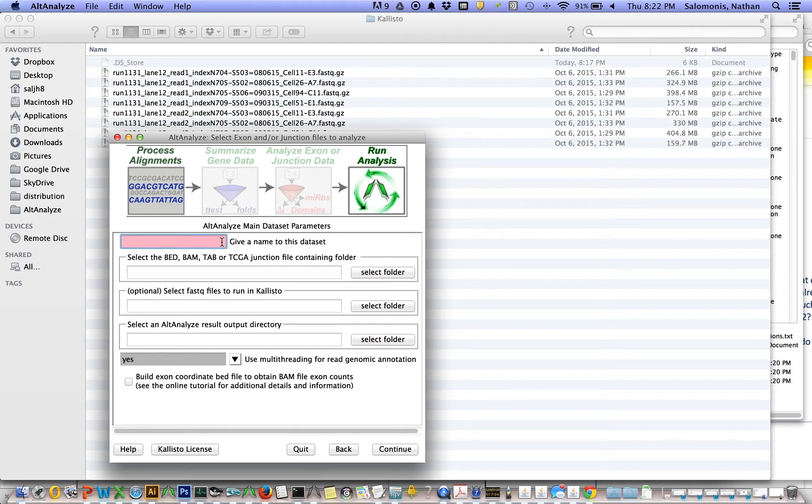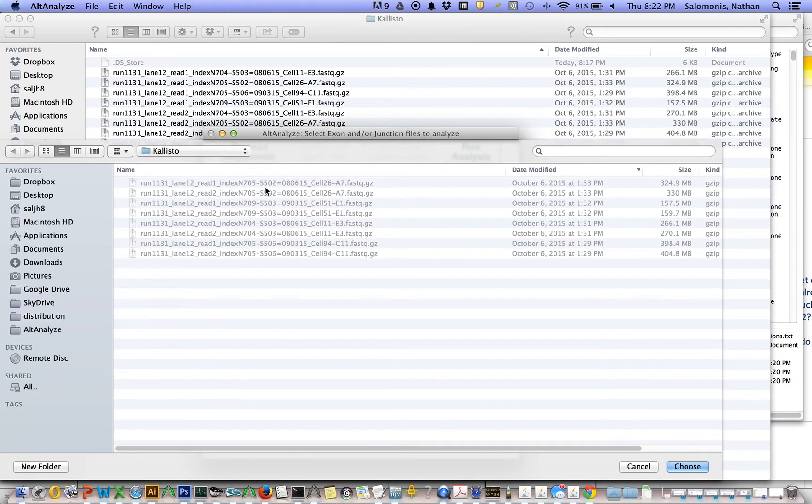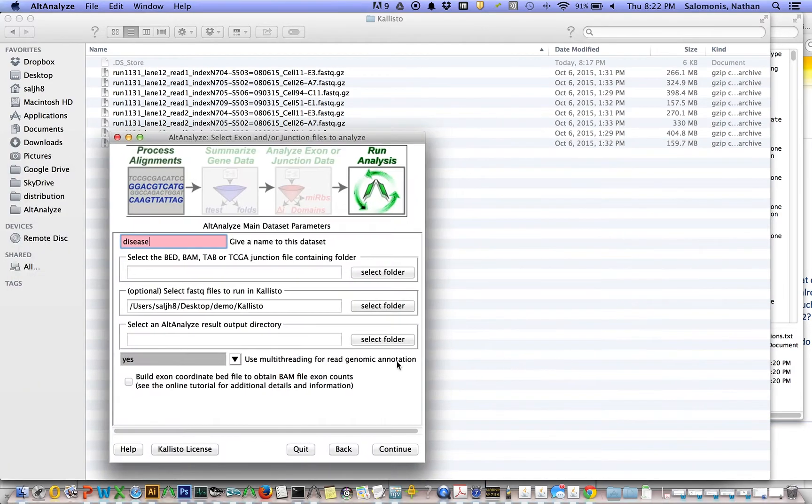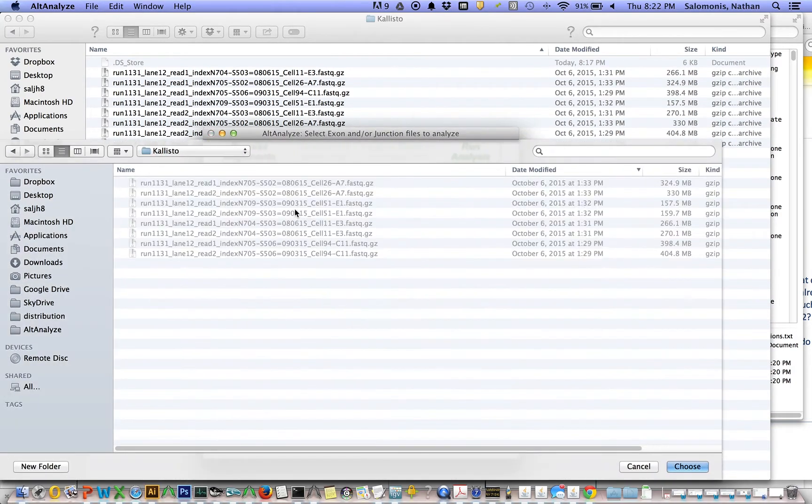I'm going to give this dataset a name, a very generic name. I'm going to select the results folder that both contains my FASTQ files and also that I'm going to write the results directly to.